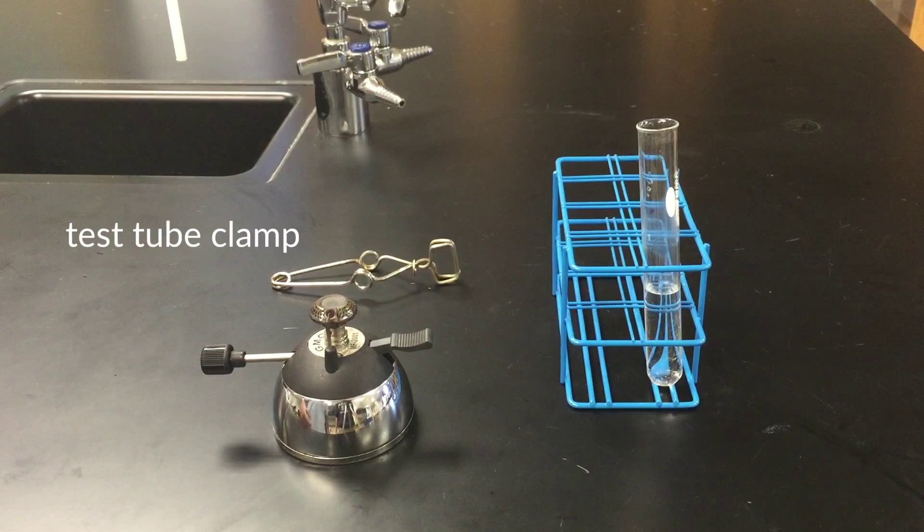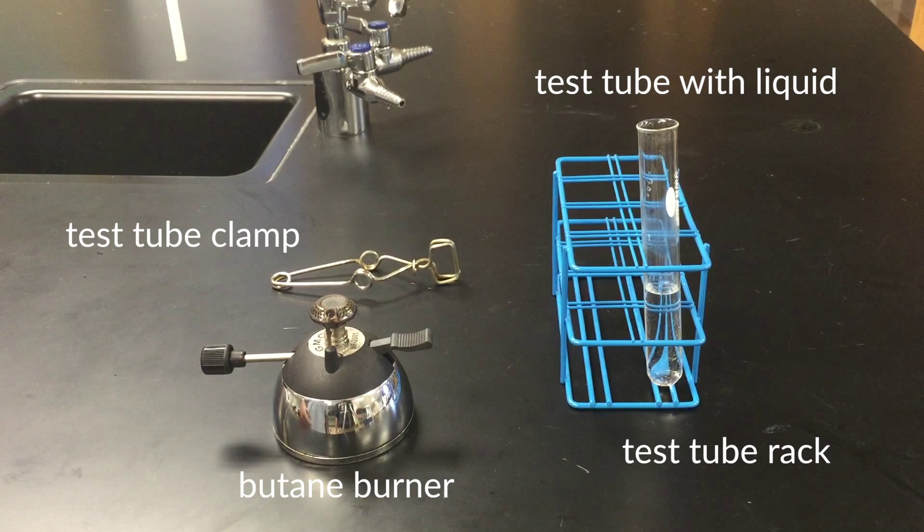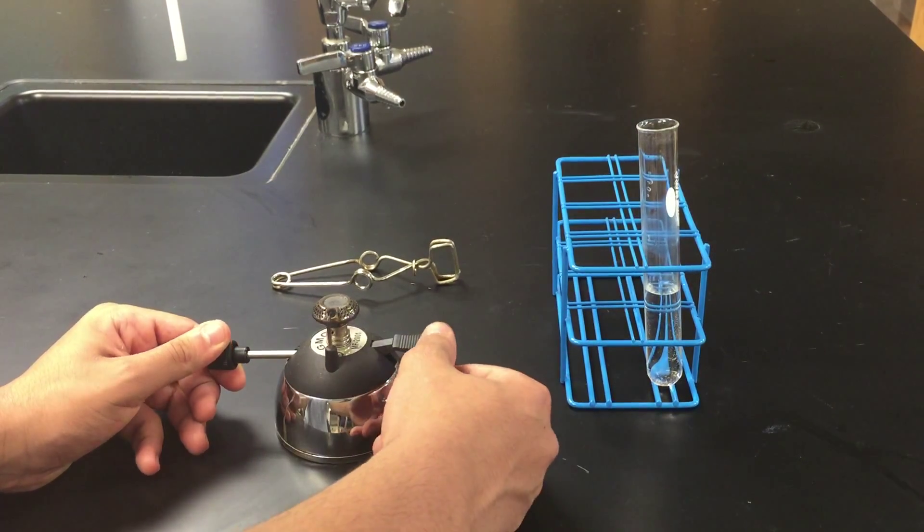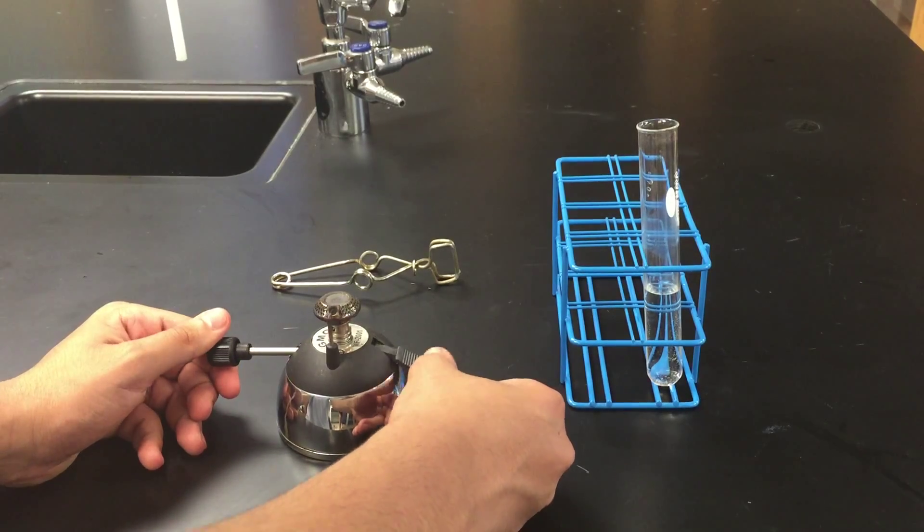To heat a liquid, you need a test tube clamp, a test tube rack, a test tube with liquid in it, and a butane burner. First, turn on the butane burner and lower the heat so it's not too high.